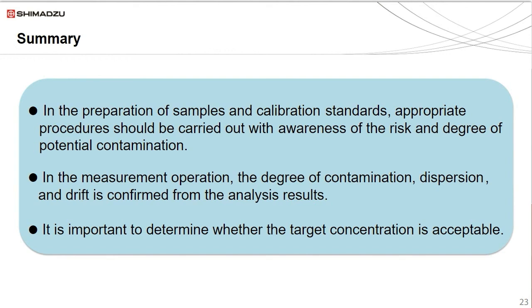The monitoring levels are 10 times lower than this after converting to concentration units with a known daily consumption rate. In this manner, an analytical SOP can be validated, and data defended effectively during any regulatory agency inspection of your laboratory.